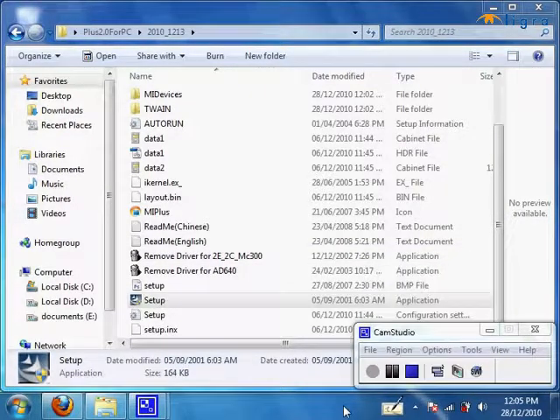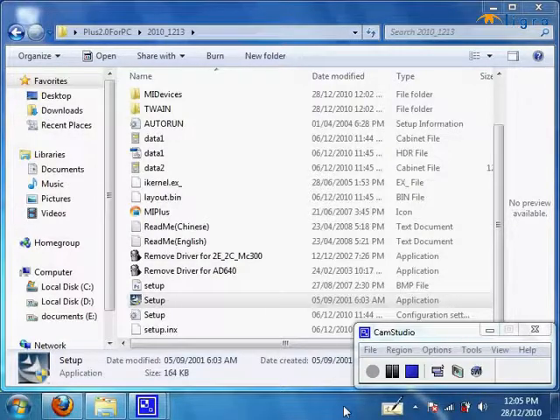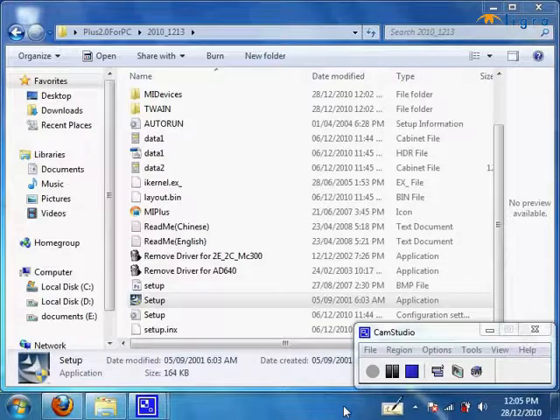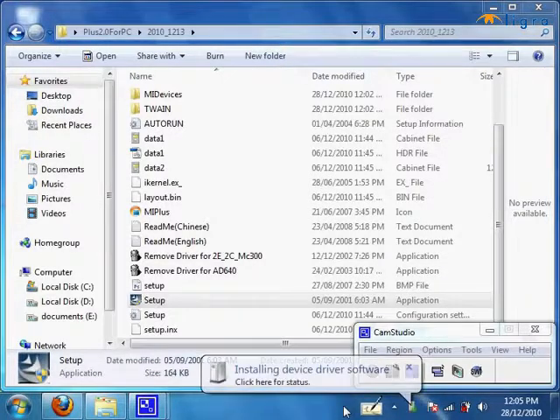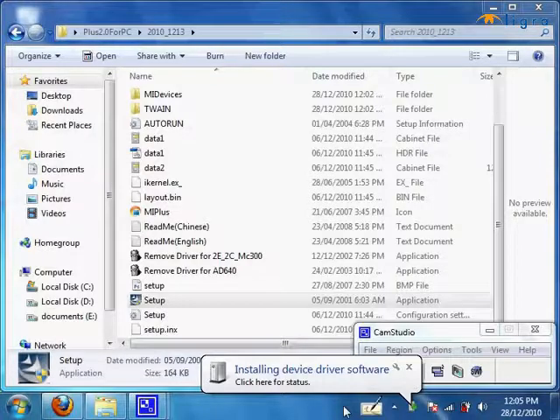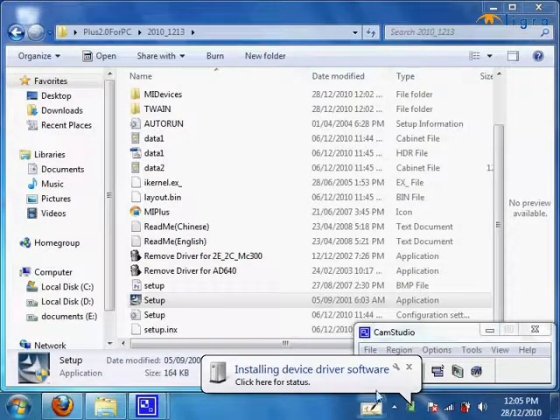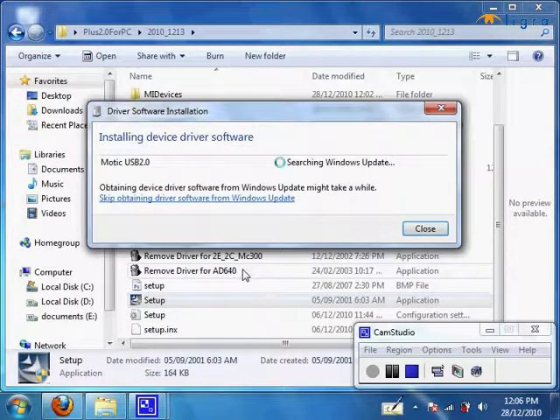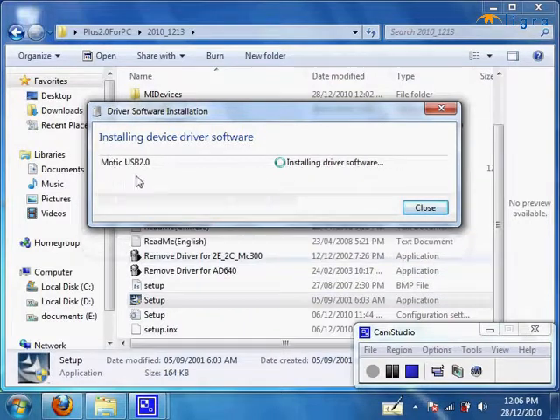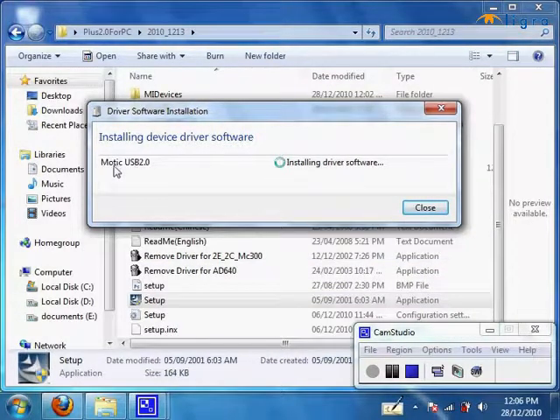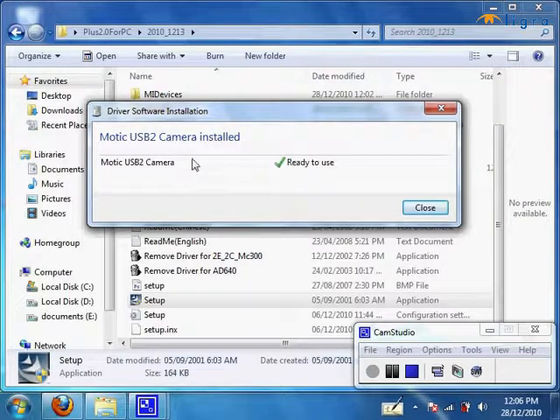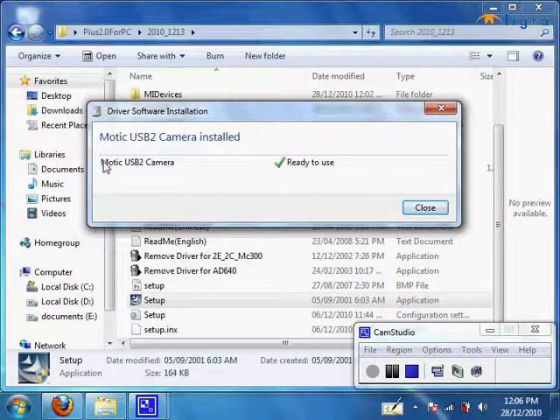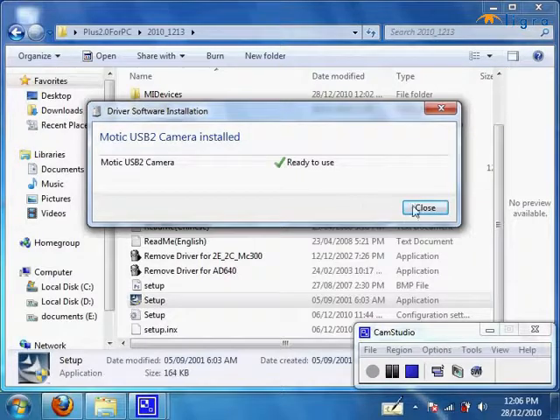I didn't get the installation driver prompt, so I'll plug into another USB port. Here we go. As you can see, the name before it installed this driver is called Motic USB 2.0 and after it's done it will say Motic USB 2 camera. It says ready to use, so let's try it out.